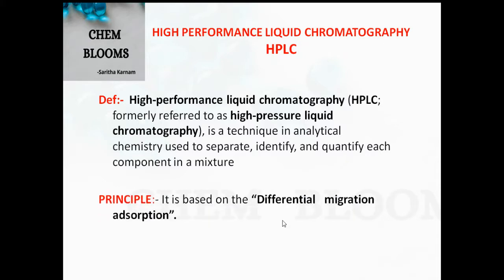The principle involved in this technique is differential migration, adsorption. So the sample components adsorb differently on the stationary phase. So depending upon the adsorption power of different components, the separation takes place.